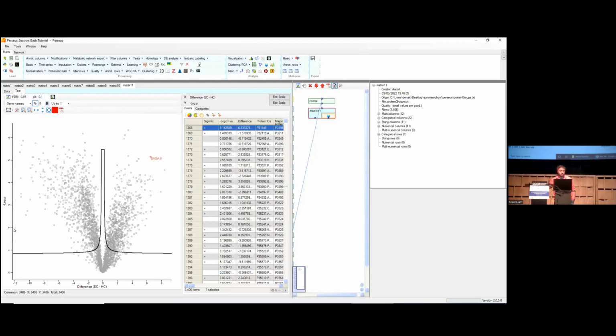Small p-values are what is representative. What you want is small p-values, but what you have here is minus the log of the p-value. When you apply this transformation to a p-value, bigger values are actually representative of lower p-values.